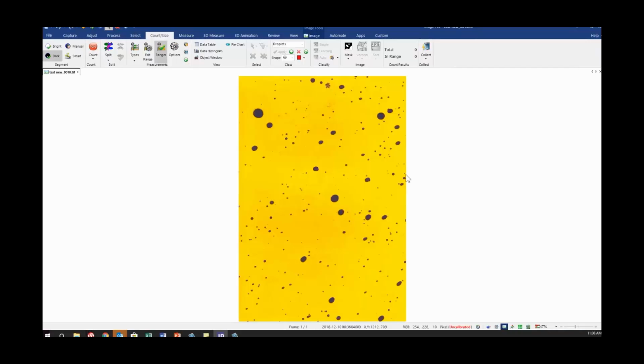Again, this is used in a lot of other fashions. There's also food gums that can be used when you use this wetting paper. They use it in quite a number of different scenarios. But the idea is I want to count the drops. All right, and my measurement options file, I can always confirm, set that up.